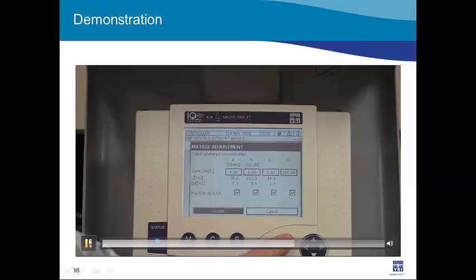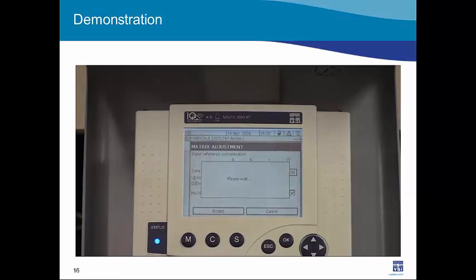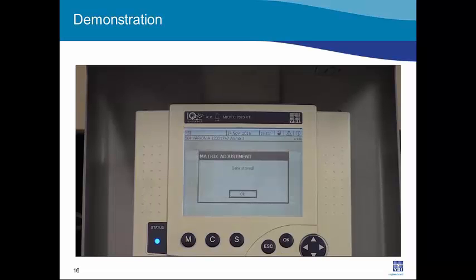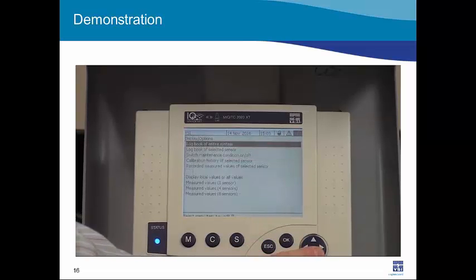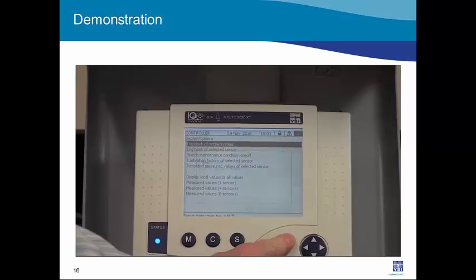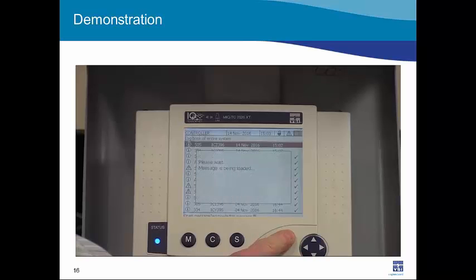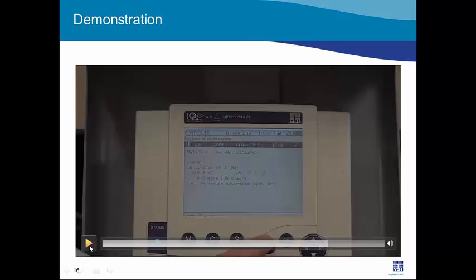And so now I can go into the system, and I can switch the maintenance condition off if I've put it on. Sometimes that's done to hold the outputs. And then I can look at each of these messages that I get right here, and it tells me what the millivolt was and also the reference concentration. This is also stored elsewhere, but this is for information, and I can acknowledge each of these messages one at a time or all at once. And that's it.